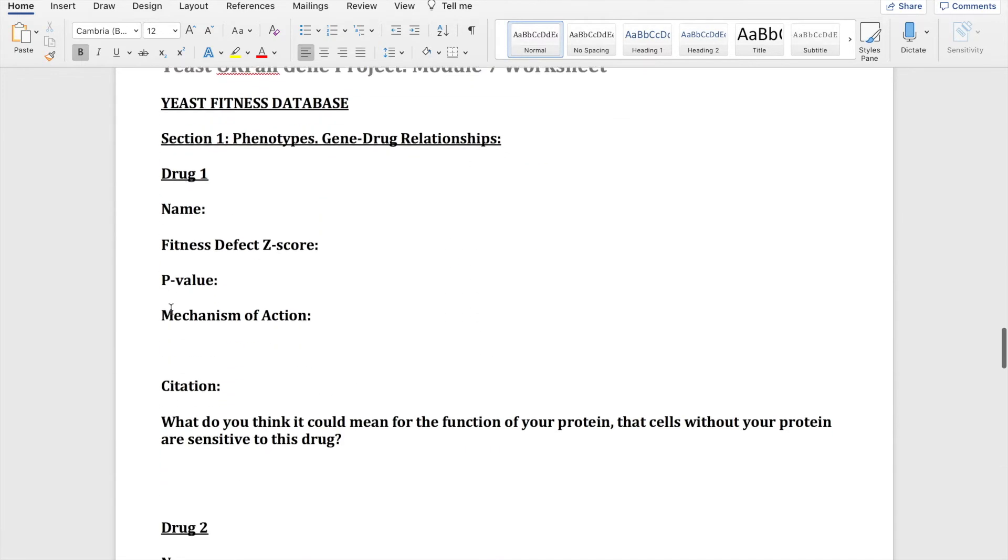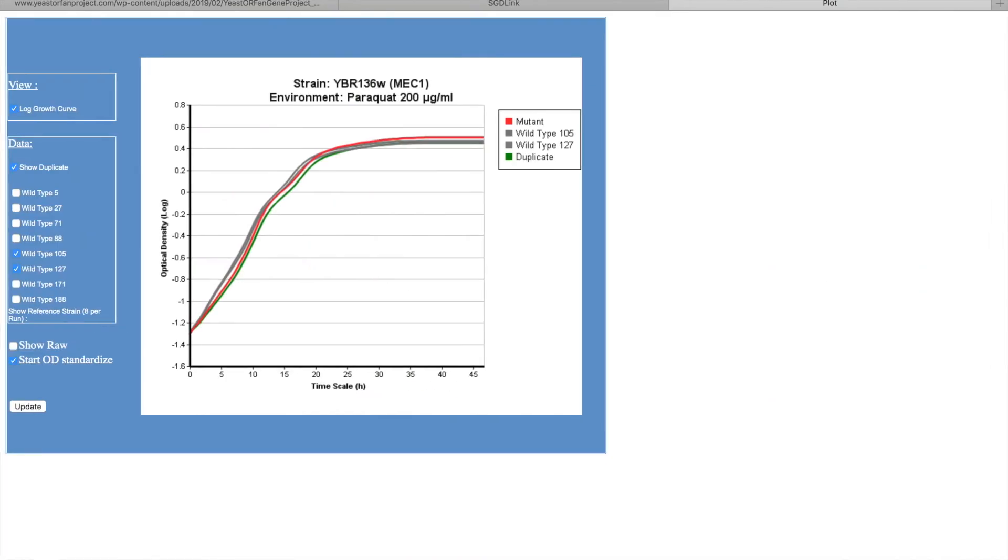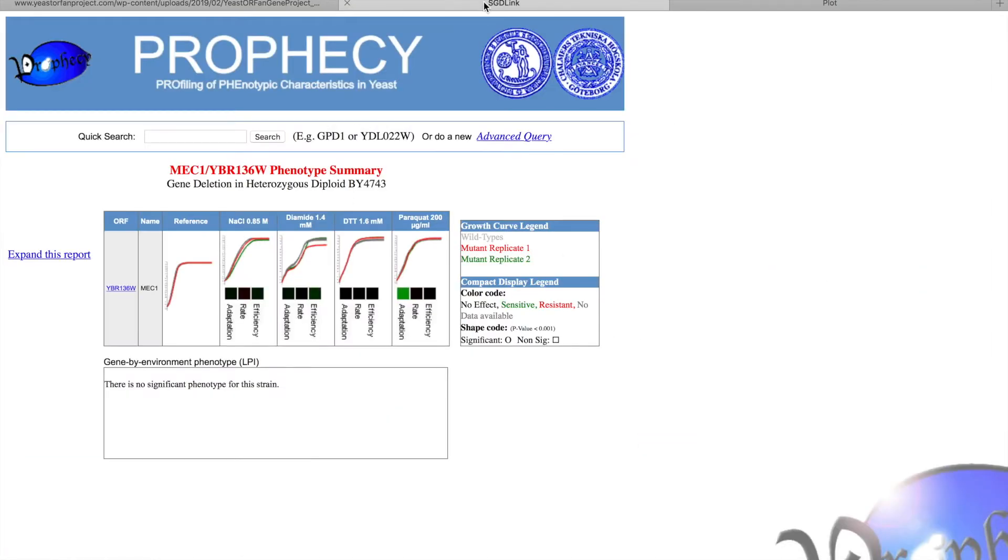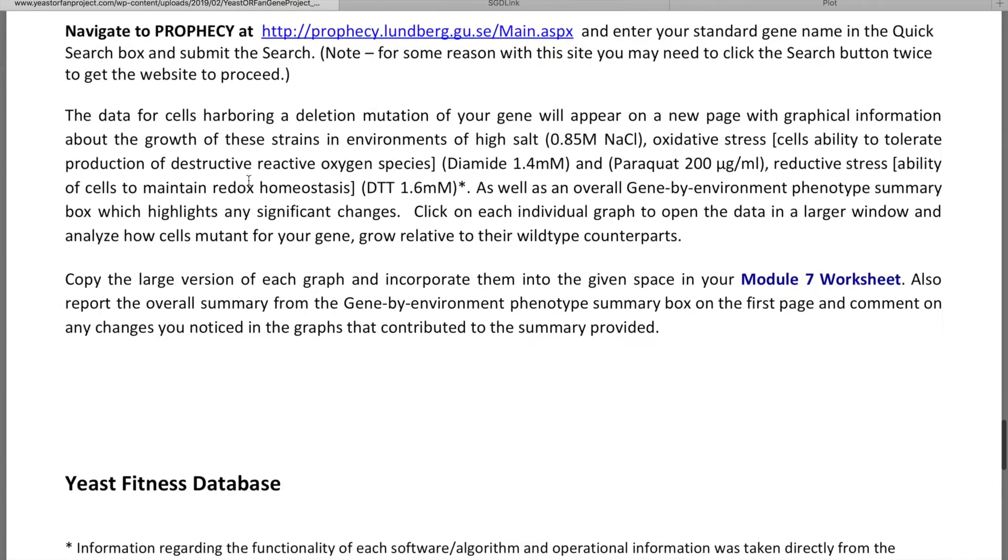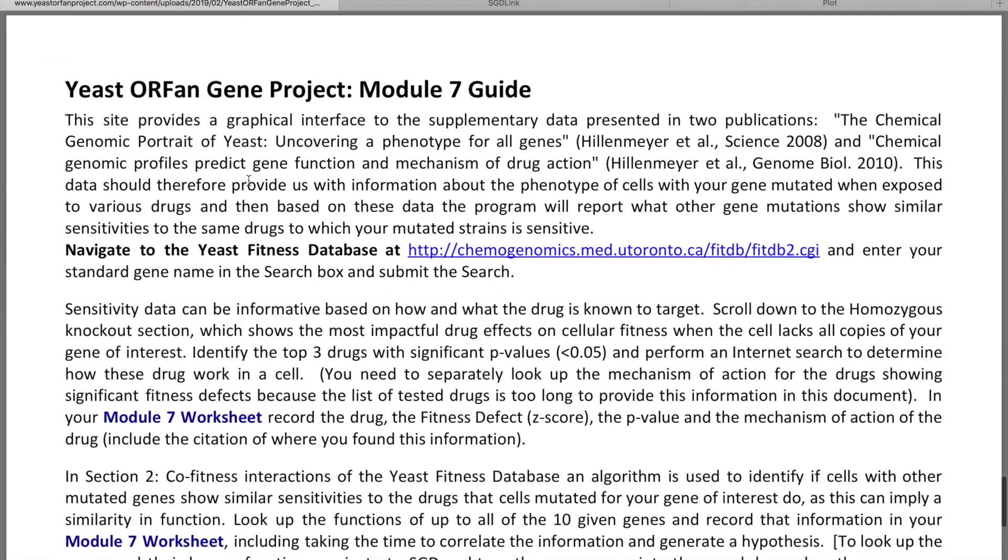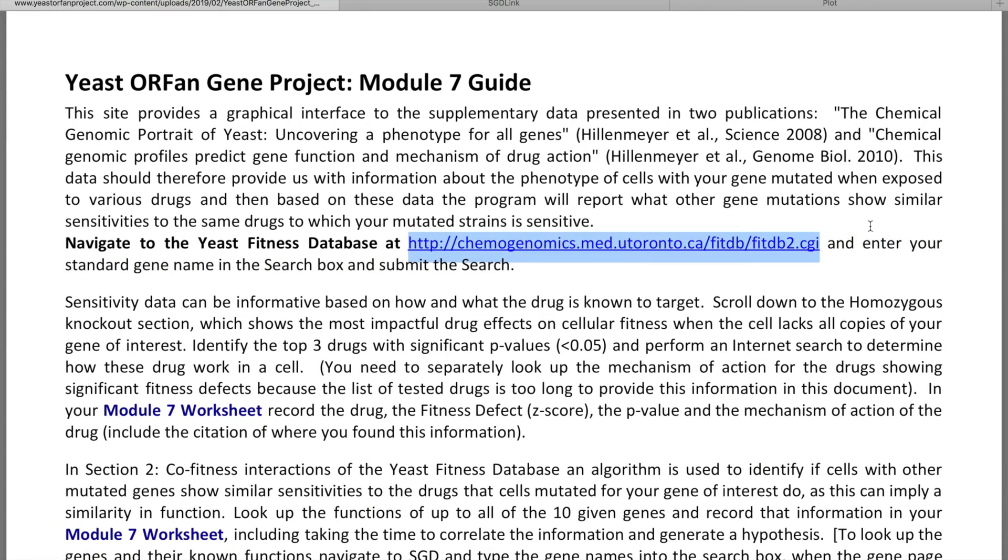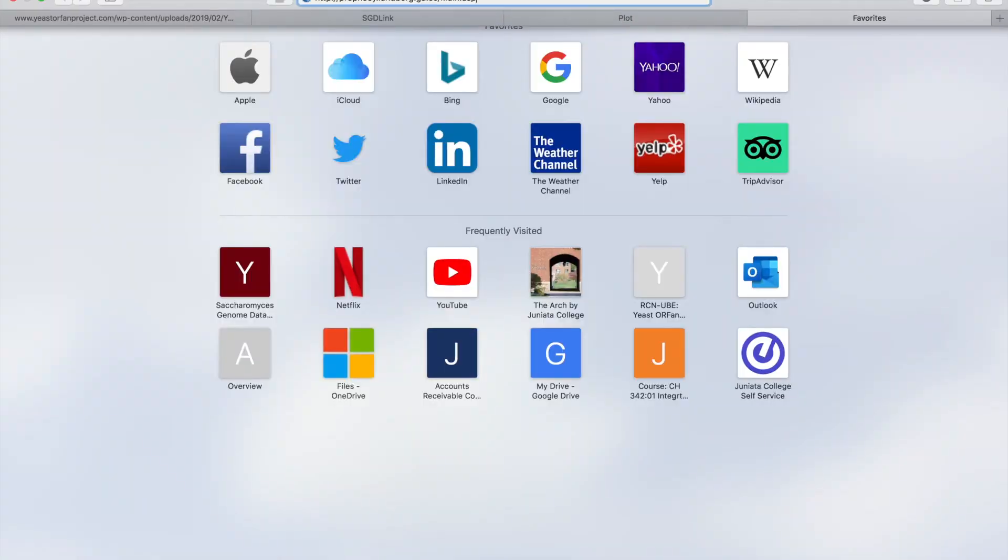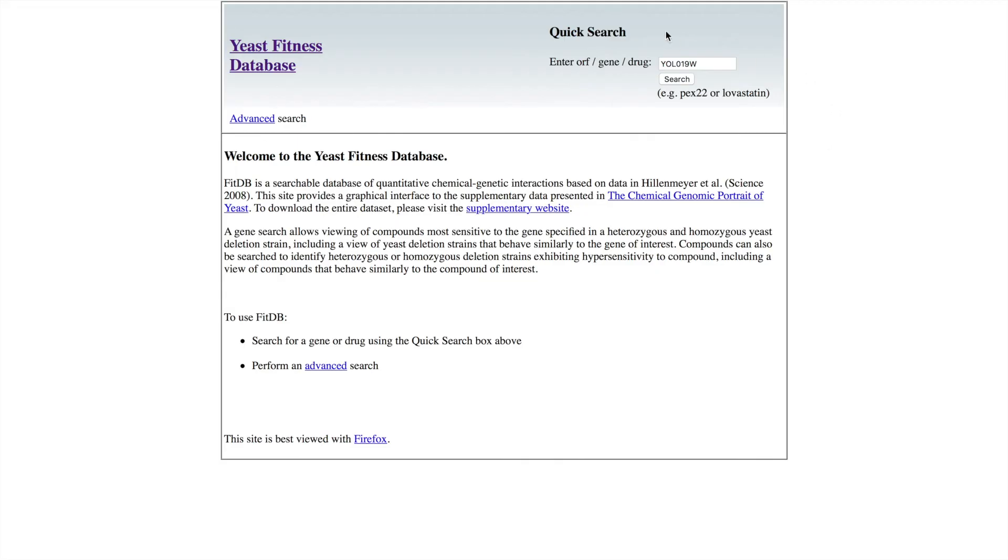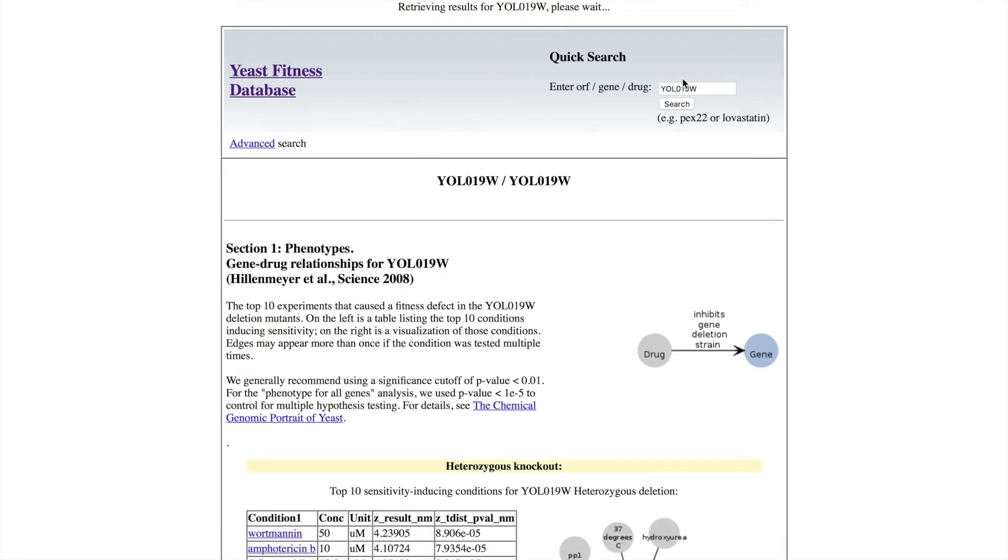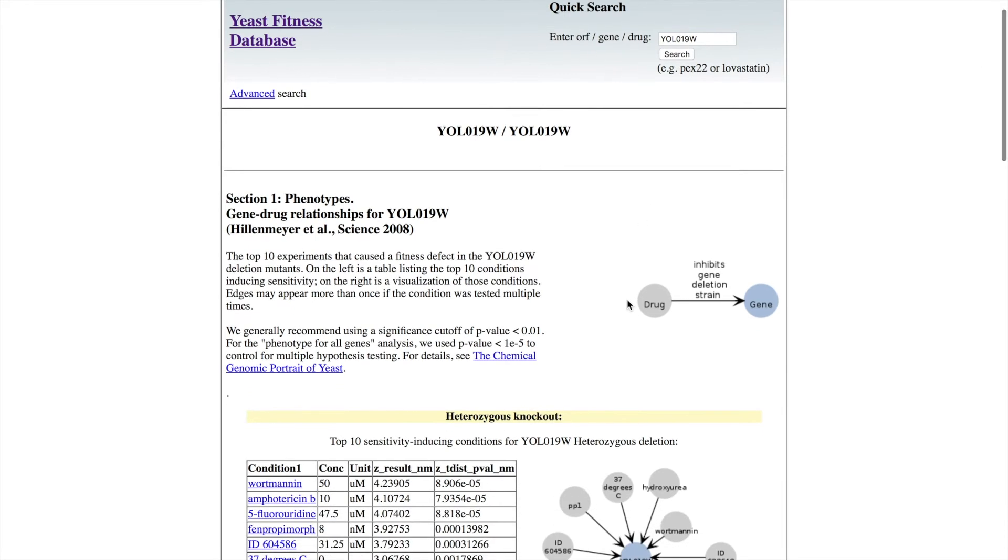Now we're going to move on to the yeast fitness database. We're going to get started and we're going to put our gene up at the top. I'm using YOL019W because I could not get any results from MEC1.